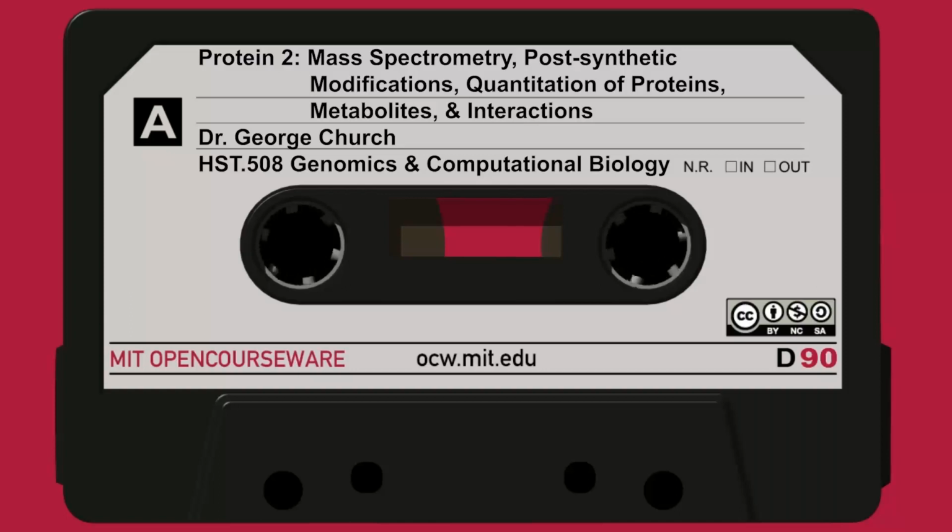You'll have a readout where, as a function of time, you get abundance, where the peaks can be measured by mass or ion counting and so on. And these can either be collected or simply run into a mass spectrometer. There are going to be 2 phases, the mobile phase and the solid phase. Talk about the mobile phase first.